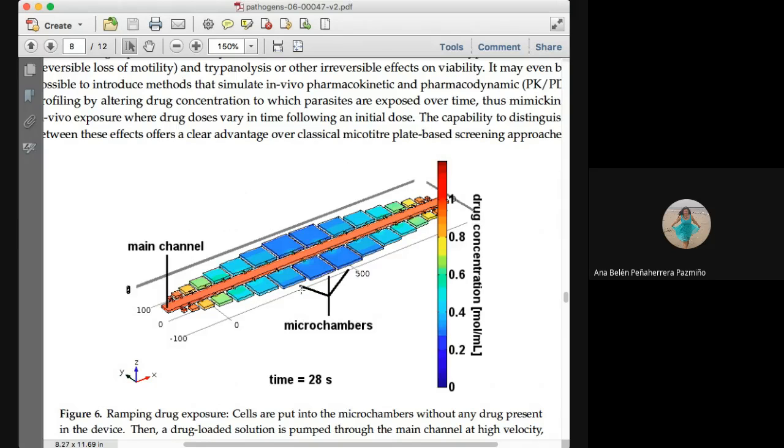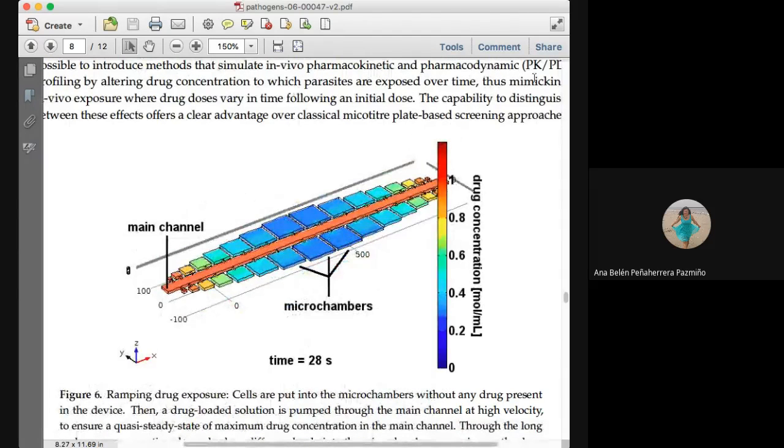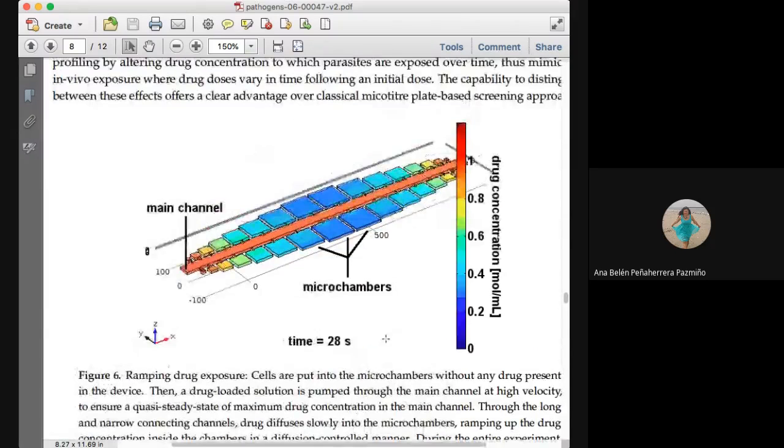This is the final study, and in conclusion, it is easy to perform and design a microfluidic device in order to get more information on this parasite that is not well studied in microfluidic devices, and it's also an opportunity to find new solutions.